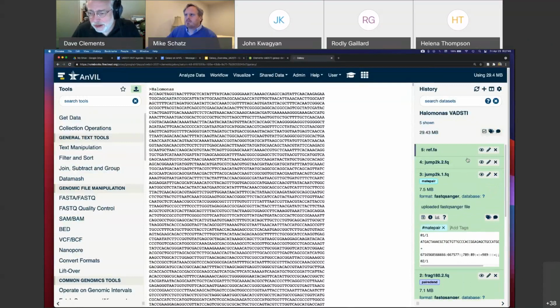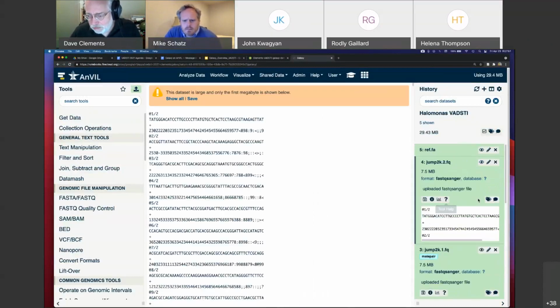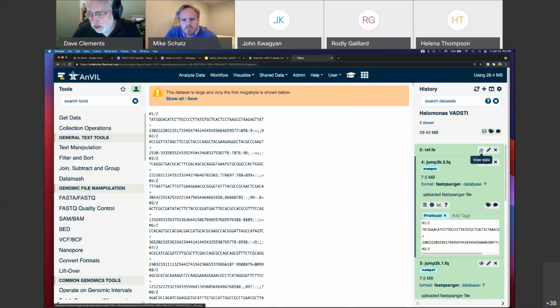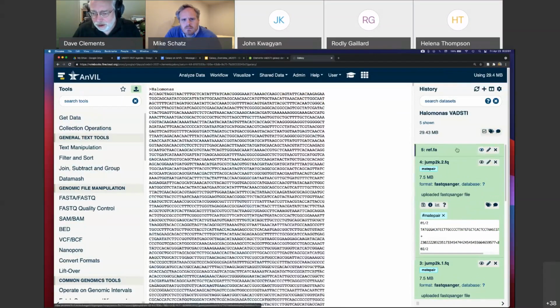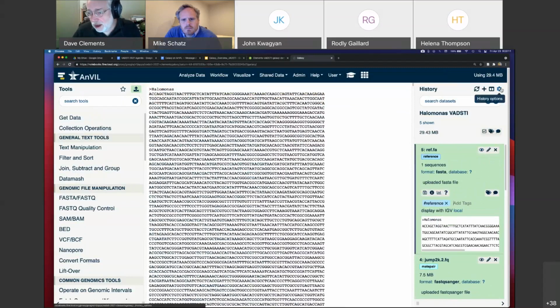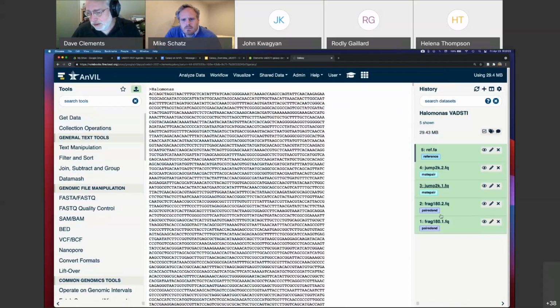Okay. And these tags will actually help us as we go. Oh, that's not what I wanted. And boom, mate pair. Come on, Dave. There we go. Mate pair. Okay, and then this guy I'm going to label reference. Sorry, that's not quite as important, but it will help. Reference. Okay. So now I'm going to go up here to my cog. I've got all my data sets expanded, which is good, but it makes that history hard to process. Clicked on the cog. I'm going to say collapse expanded data sets, which brings me back to here.